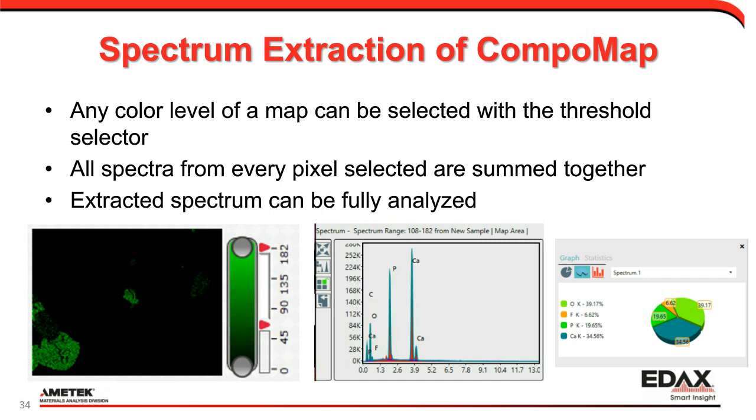In this case, we're looking at the net intensity map, and we select the intensity of that area. It'll highlight it on the map, and then we click on the button on the histogram slider, and it extracts the spectrum from each pixel that's colored, that's selected. So really it's grabbing a color intensity that's representing a concentration, and then it's extracting or harvesting just those pixels.